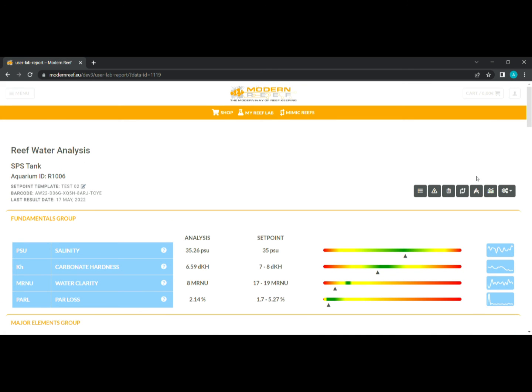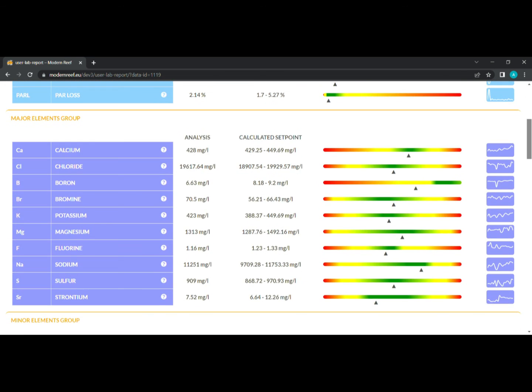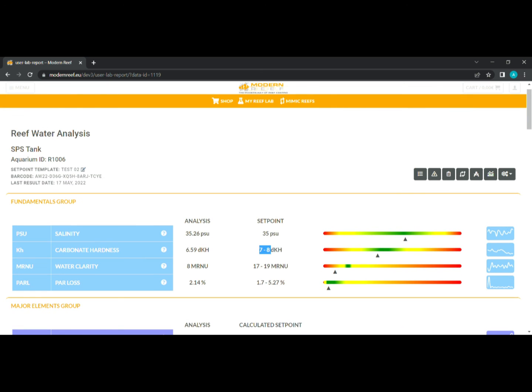Okay, so if you go to template, here it's already loaded, still loaded because we edited. Instead of information, we can edit from here, and you can see that it changed it from 7 to 8. So this system will advise you how to reach this value, and that's how it works. So yes, this is mainly it for now.